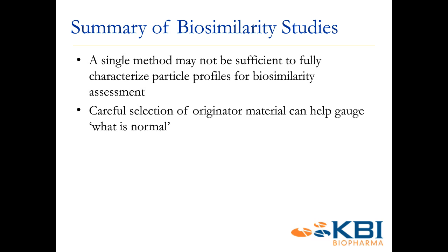A lot of times for clients, we will take material that's about to expire and literally analyze it the day before expiration to try to get a good gauge of what is normal, what's kind of the boundary of particle profiles you can get from your originator material, to then fall in line with that.